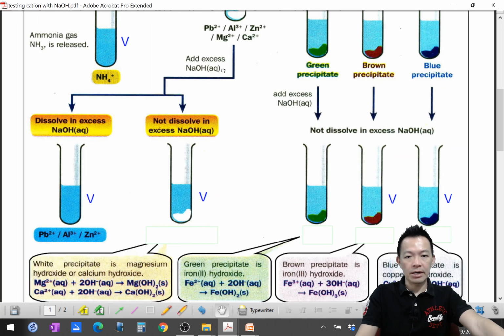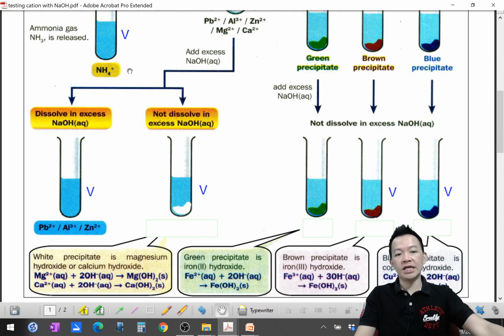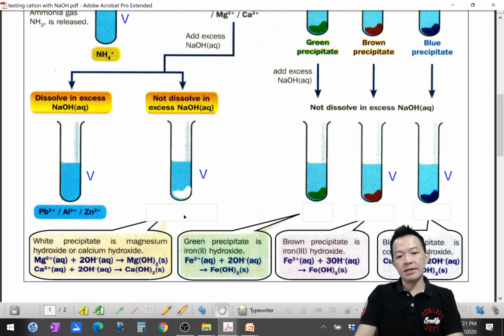If you add the sodium hydroxide in excess, 你刚加一点点, 它出白色. 你加多多, 搅搅几下, the white color precipitate soluble, dissolve in excess of sodium hydroxide, 溶解在多余的 sodium hydroxide. So 那个就是 lead, aluminium, and zinc. 这3种, 当它形成白色的 precipitate 过后, 它溶解在多多的 sodium hydroxide. Okay, and another ones, they will be insoluble. 另外一组呢, 你加多多, 它白色还是白色, insoluble, 完全不能溶解.